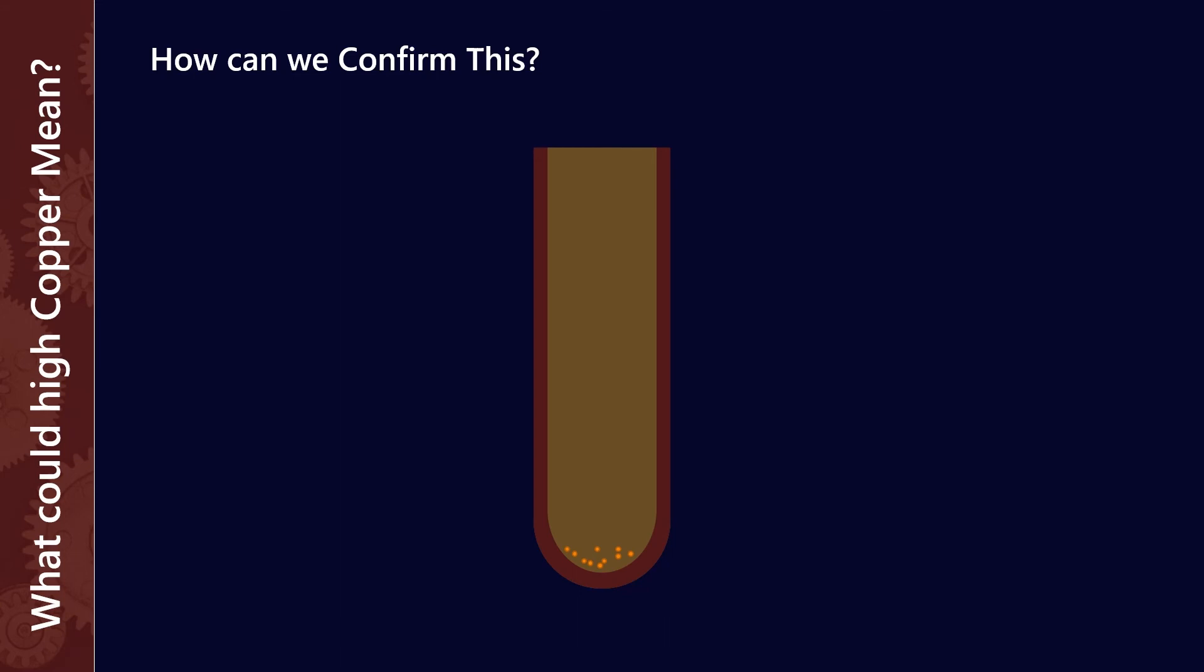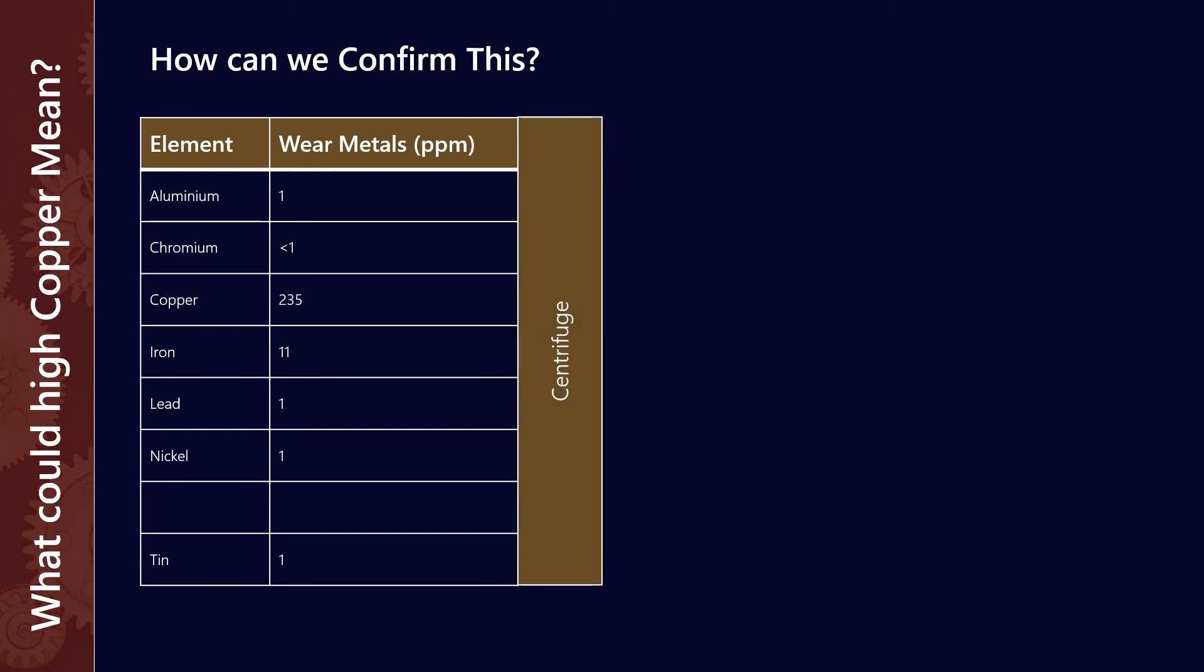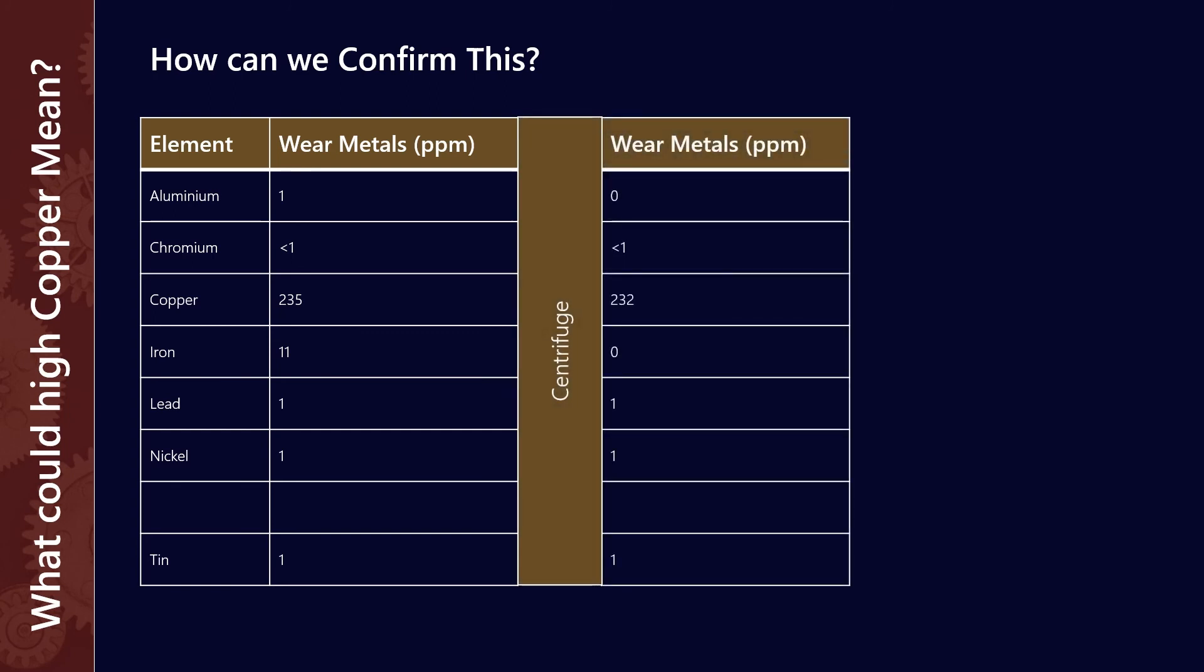So if we were to retake the oil out of this test tube and put it through the ICP machine we should see much lower levels of copper. All right so going back to our example we had 235 parts per million copper. If we were to get the lab to put it through the centrifuge and after that we saw very similar levels of copper this would give us confidence to say that it is passivation and not wear.